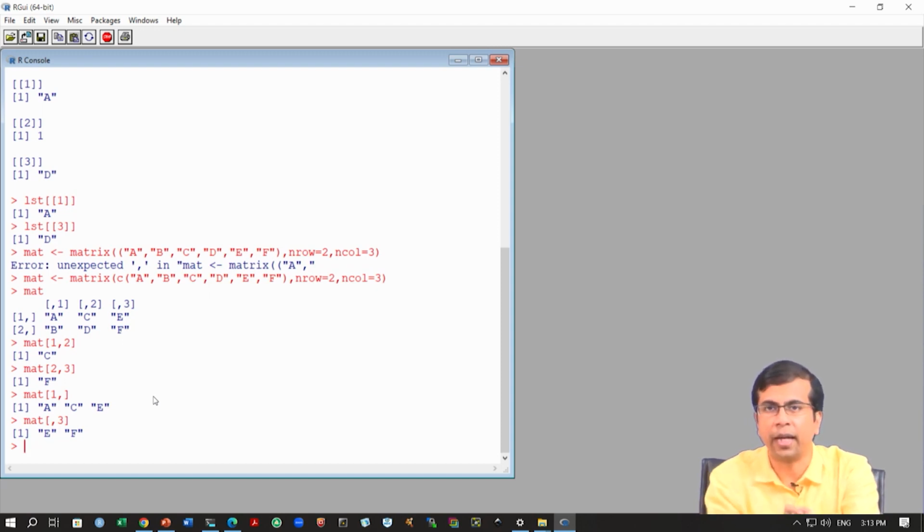So, remember this matrix part, because this is very important. This will actually come up when we start loading our data. There is another concept called the data frame, which could be a combination of all these different data types. All right, so I think this is clear, how we get to the different types of data and how you start working with them. What I will do now is load the data that we have, the raw count data that we have generated, and we will start performing some operations on this data set.